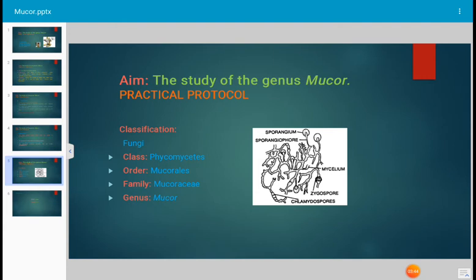Regarding classification, this fungus is a member of Phycomycetes. The order is Mucorales, the family is Mucoraceae, and the name of the genus is Mucor.